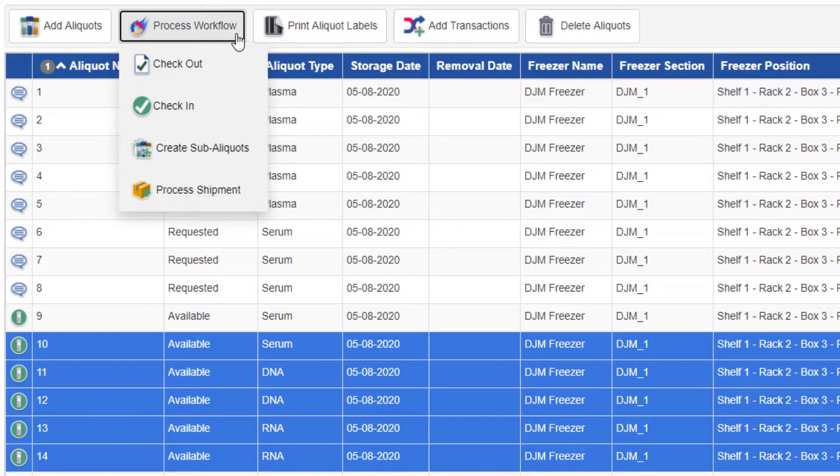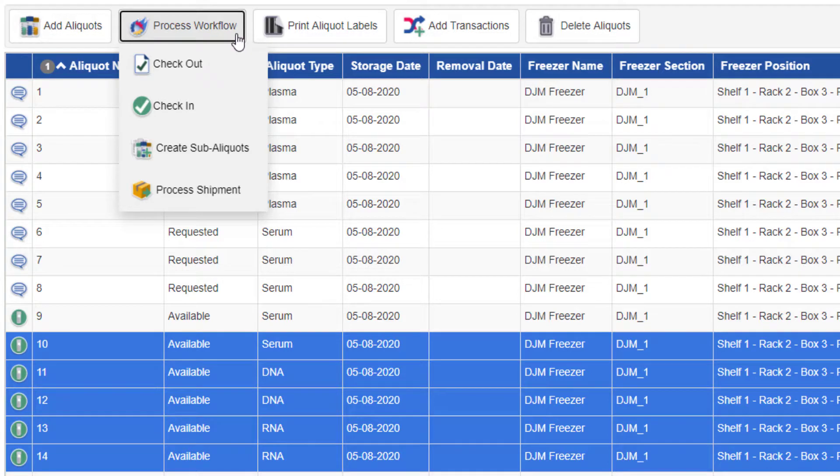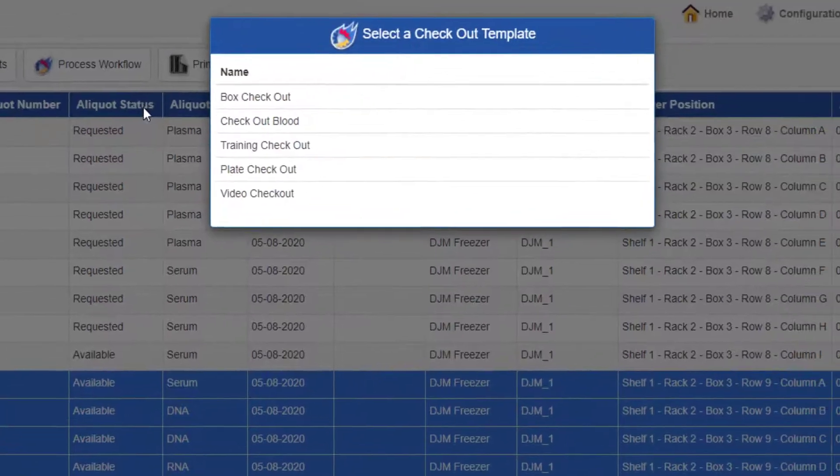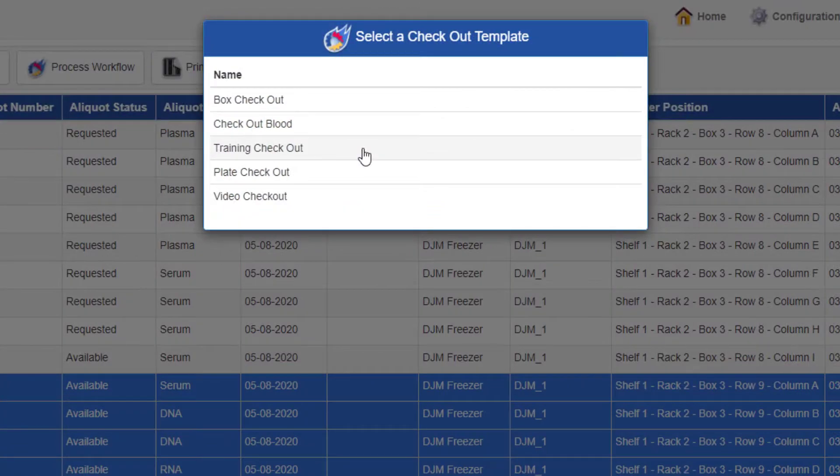This opens a menu with the four possible workflow types. From here, it's just like the inventory list view. Select the type you'd like to run and choose your template.